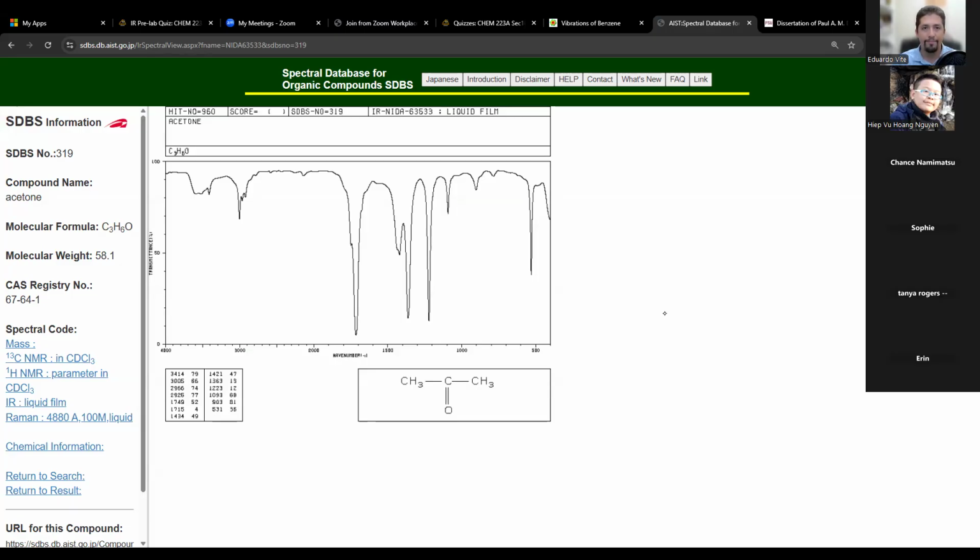Right? So you see here, you have your carbonyl. Let me see, annotating, drawing. Here you have your carbonyl right there at 1700. There's 15, 16, 17. So this is at roughly 1700. If you want to know exactly where it is, you could just find the number, right? So look, it's at 1715 and the transmittance is 4. So that gives you the intensity. So this 1715 is the carbonyl. You can tell me this is at 1715. You can find that right here.